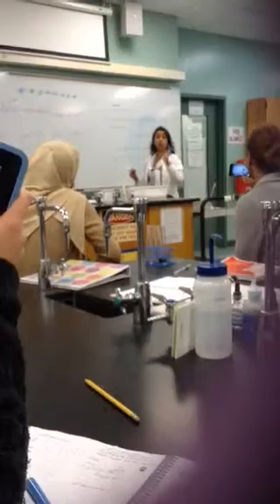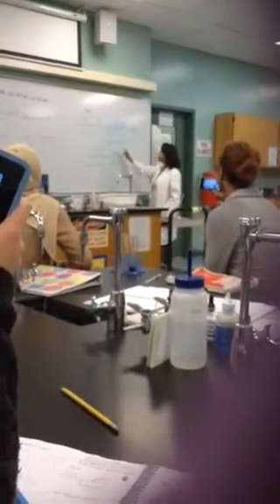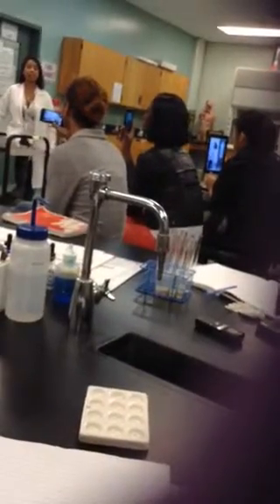But this is what you're supposed to get, pay attention to this. In test tubes 3 and 4, you're supposed to get positive for Benedict solution, meaning you're supposed to have a red brick solution because amylase digested the starch. So you have to have a positive result for Benedict, which is reducing sugar.